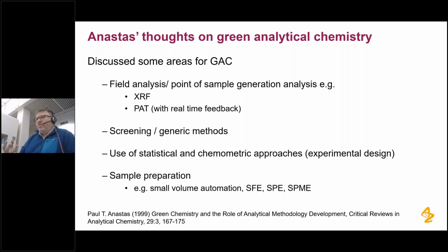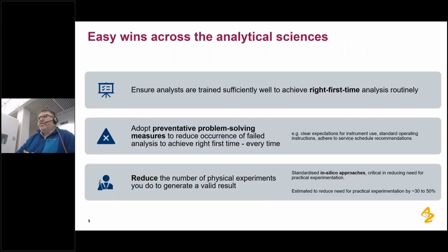And aside from that, can we then also start to reduce the volumes of materials that we're making, so that we're not having a great impact on sample preparation? So these are some of the key easy wins that we can achieve as analytical scientists when we're trying to deliver our method development strategies.